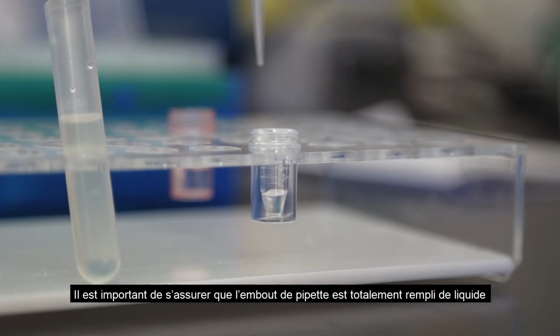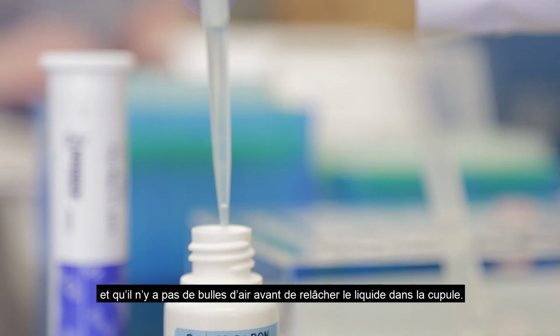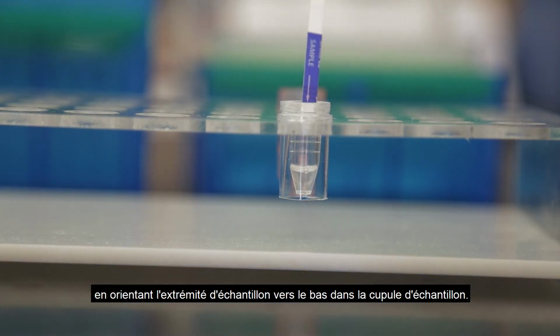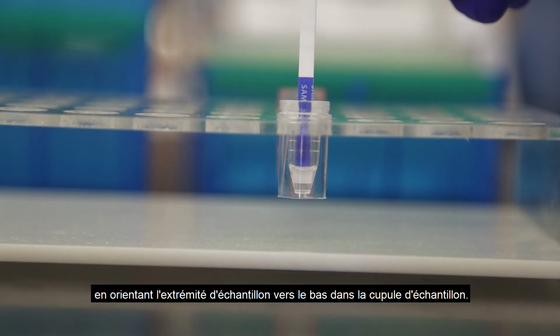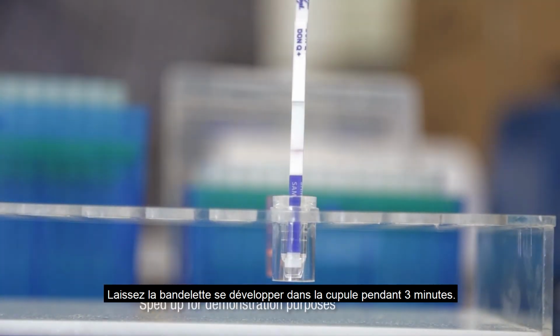It is important to make sure the pipette tip is fully charged with liquid and doesn't have any air bubbles prior to dispensing the liquid into the cup. Place a Reveal Q+ for Don test strip into each sample cup with the sample end down. Allow the strip to develop in the sample cup for 3 minutes.